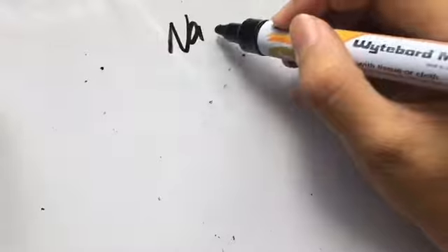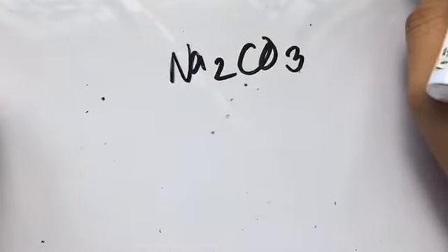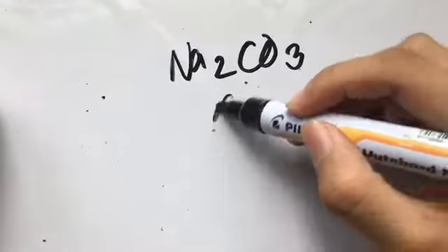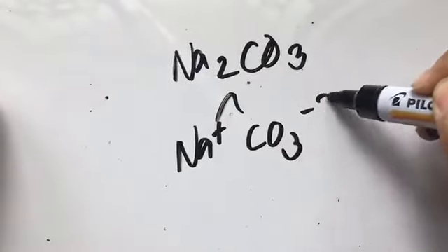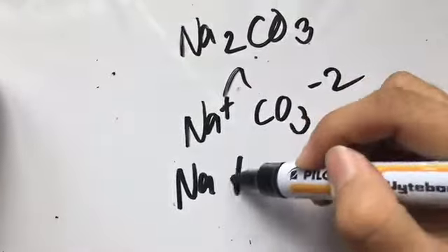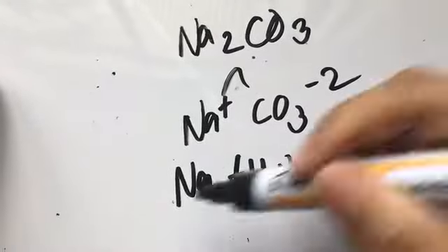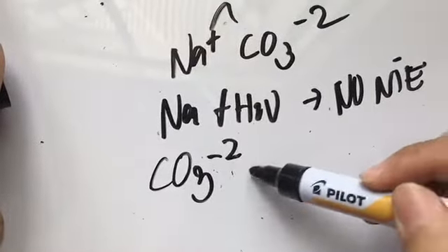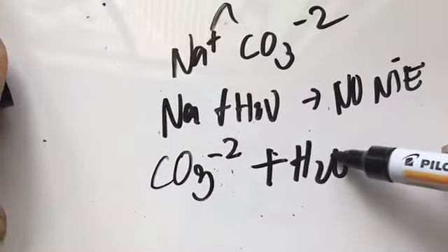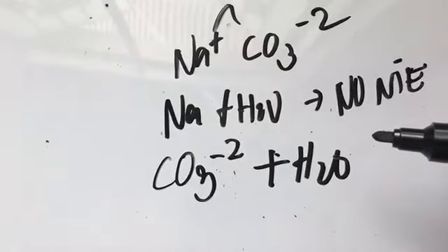Okay, next, we have sodium carbonate. So sodium carbonate, it will dissociate into sodium and a carbonate ion. Okay, so Na plus H2O, it will have no net ionic equation. Walang magiging reaction sa kanilang dalawa. And CO3 2- plus H2O, may magre-reaction kaya.